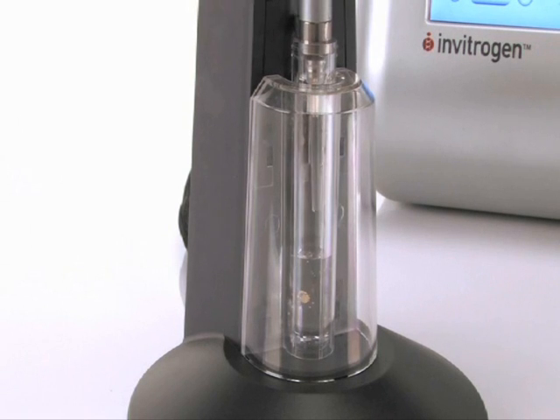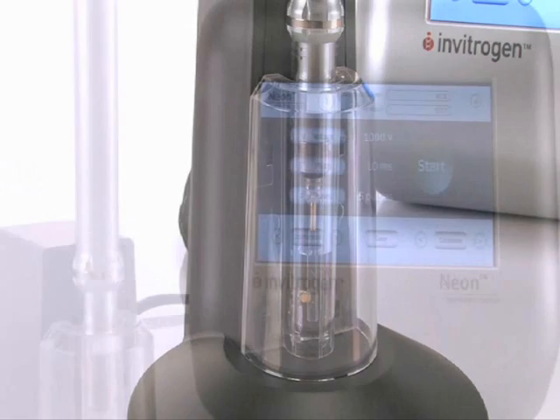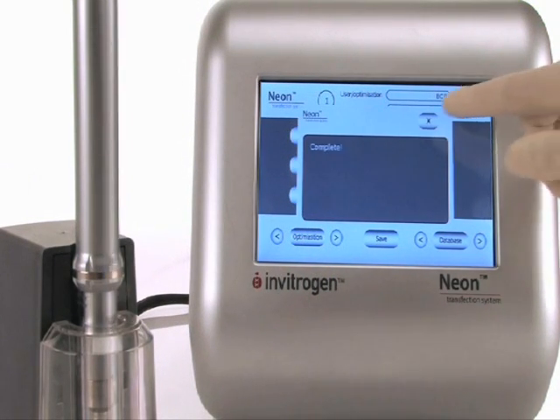Plug the NEON pipette into the NEON pipette station. You are now ready to transfect your cells. Select your protocol and press start. Your transfection is now complete.